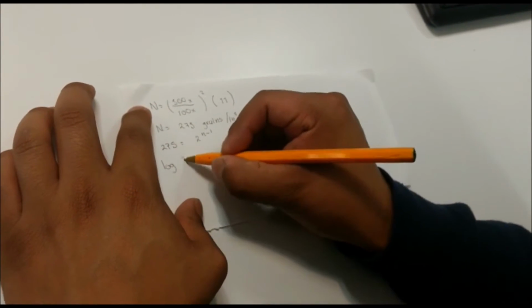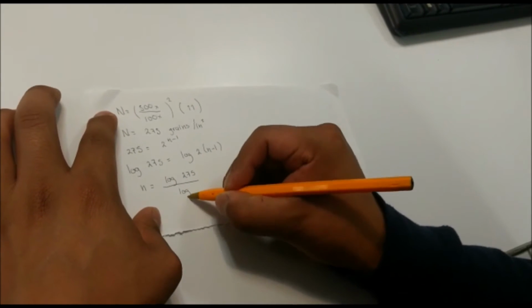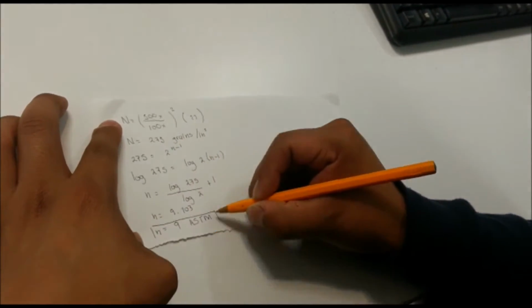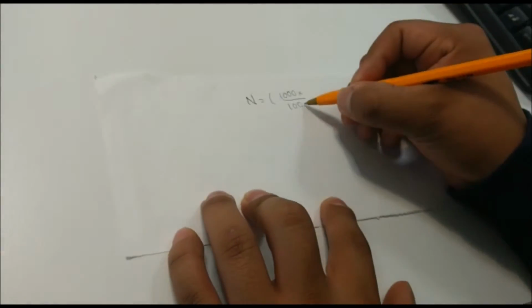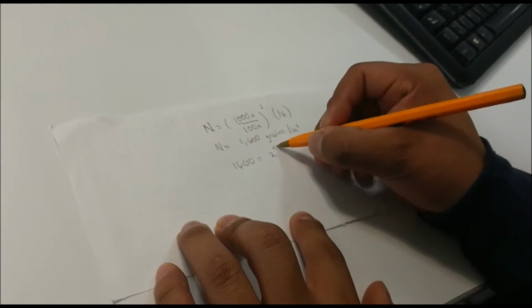To calculate the grain size number, it was necessary to solve for N, which means American Society for Testing and Materials. With this in mind, we determined that the grain size numbers for both metals are 9 and 12 ASTM.